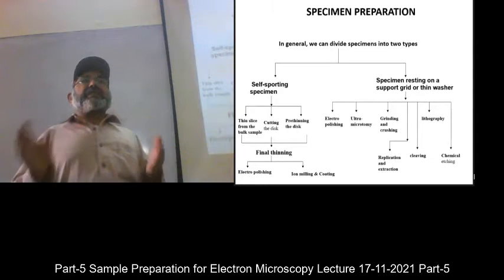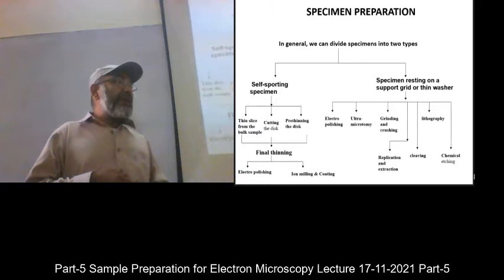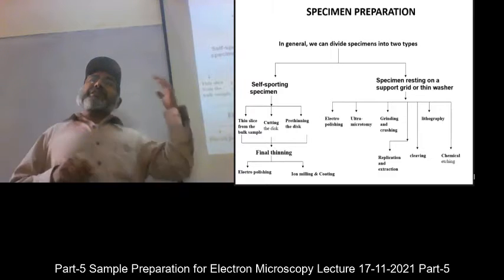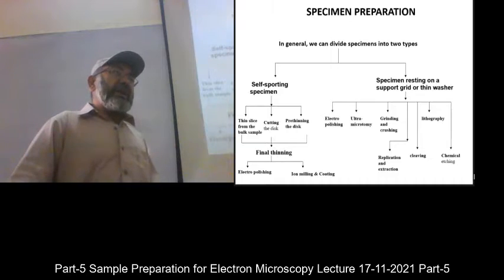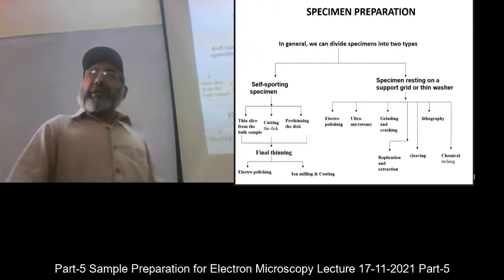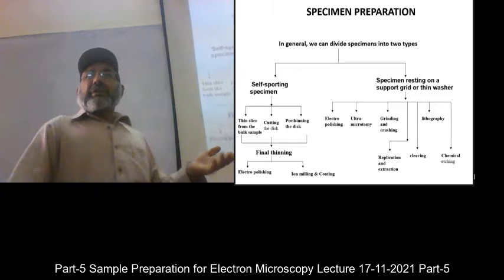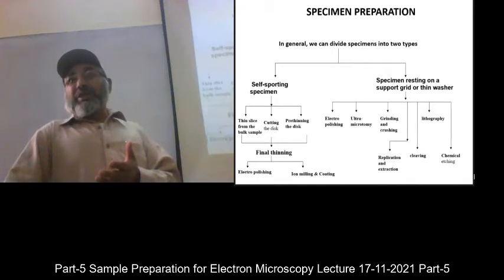Secondly, is the specimen representative of what you are studying? Just like if you take a piece from somewhere and it is not representative of that material, as I told you, in minerals we commonly have different materials within a mine, and the mine may be containing 95%, for example, diamond, and 5% quartz.